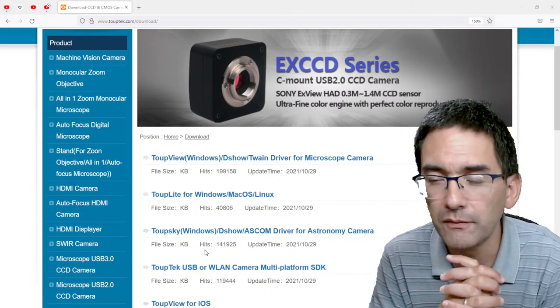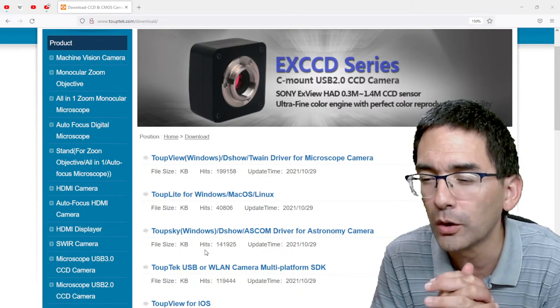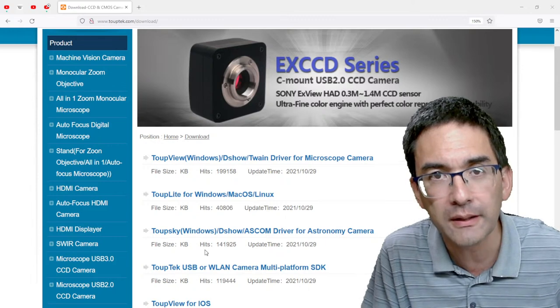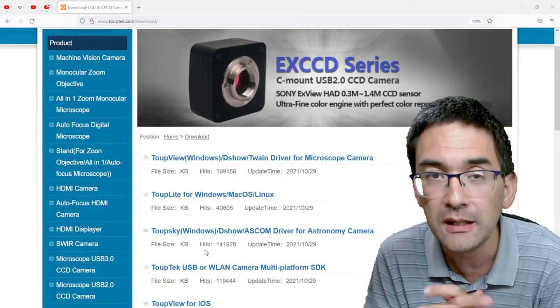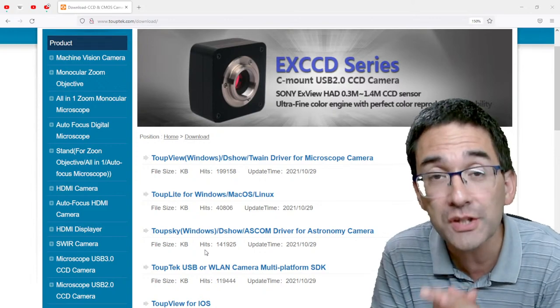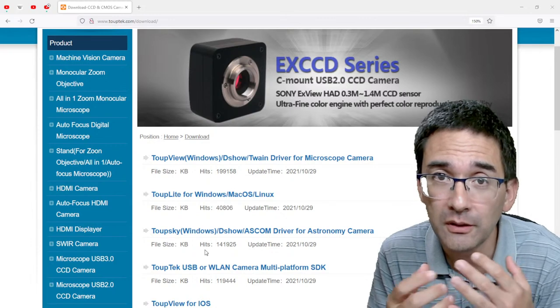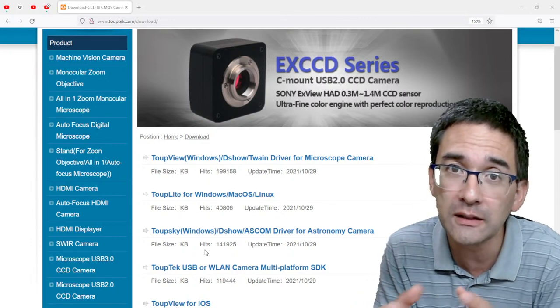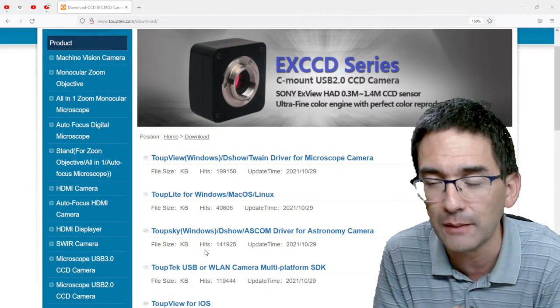So very briefly, because it's correct, there is a comment here, it doesn't work with all cameras. This is correct, but if you do not have a camera, then you can still save the pictures on your hard disk, and then you can open the pictures in the program and then continue processing them over there. It's correct if you want to take pictures directly with a microscope camera directly into the program, then this is limited to certain cameras only. Okay.